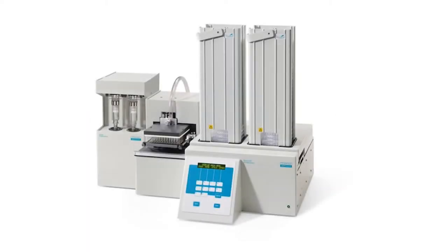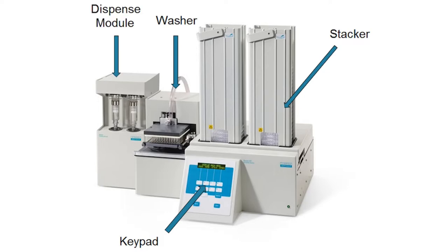This is the Zoom HT washer for 96 and 384 well microplates. The instrument includes washer, stacker and keypad for operation. It is upgradable with an optional dispense module.